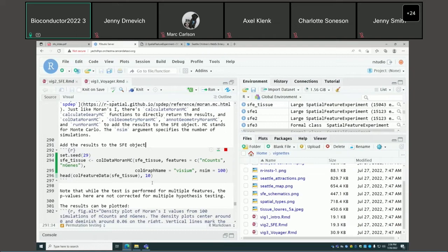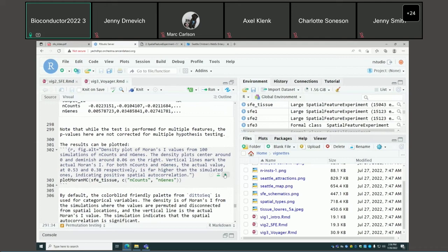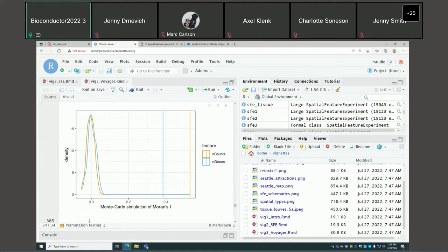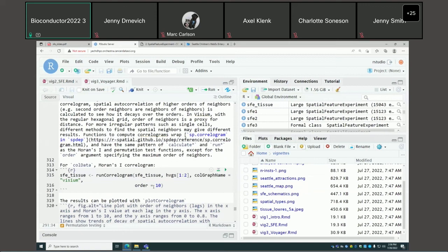You can perform permutation testing to see if Moran's I is statistically significant. These are the permuted values, and these are the actual values — it's very significant for the encoded genes.